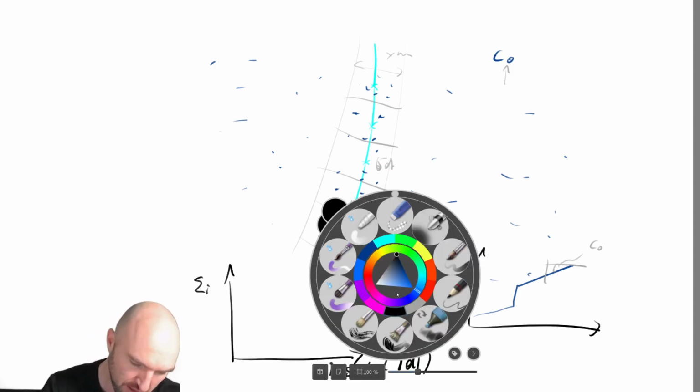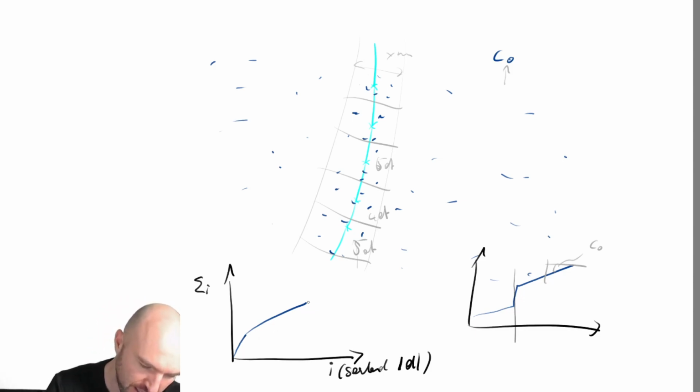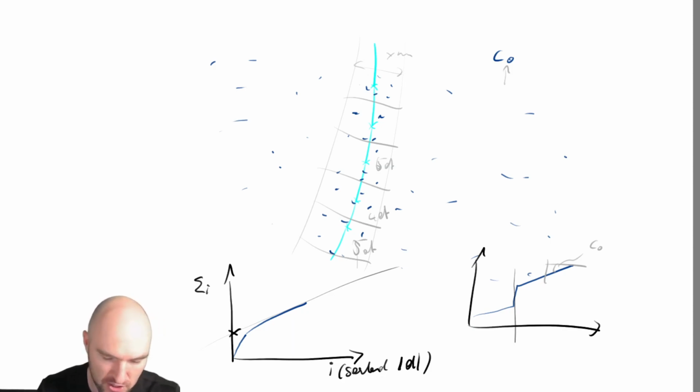the absolute value. And the reason for that is then the whole fitting process becomes a lot simpler, because what you're going to get is a curve that looks like this. So it's essentially this curve at the interface here wrapped around itself once. And the good thing then is that you only need one linear interpolation. Sorry, that was not a particularly good one. So you need one linear interpolation, and you get your interfacial excess count at the interface. No partial excesses, but just the absolute excess count.